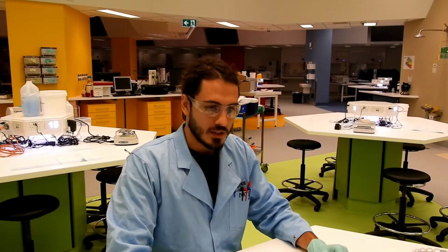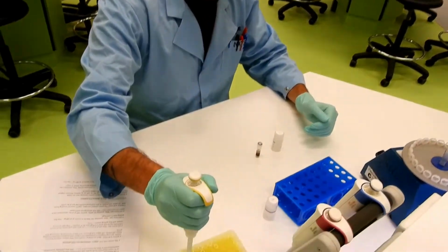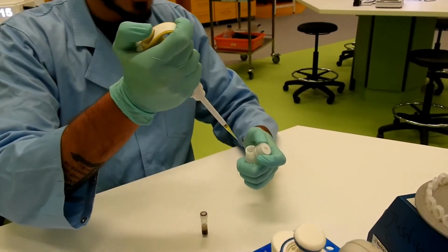The next thing we'll do is add our C1 solution. This solution contains SDS and other anionic detergents which help to break apart the fatty acids in the cell membrane. We'll pipette 60 microliters of this C1 solution into our sample.